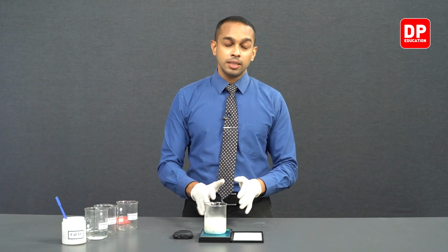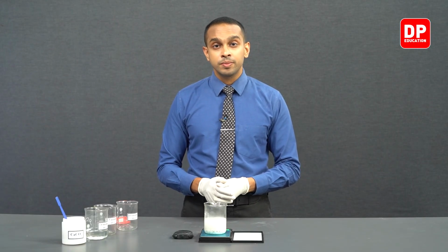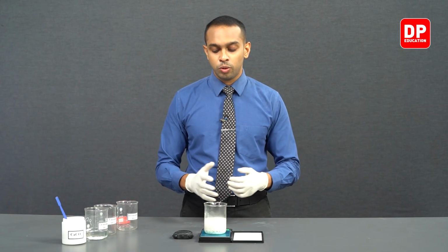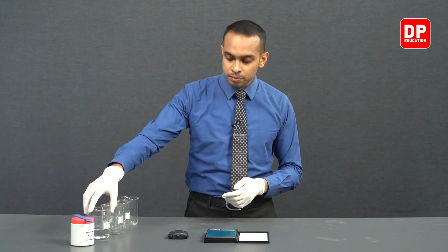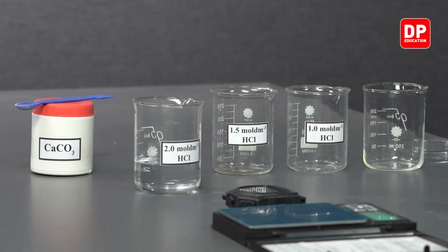So students, this is our second part of this additional experiment. We observed how the mass readings are changing, and now it is time for us to move on to our third and the final part of this experiment, where we'll be using 2 moles per decimeter cube concentrated HCl solution. We are going to repeat the same reaction but with a different concentration of HCl solution. So we will be using an HCl solution that has a concentration of 2.0 moles per decimeter cube.